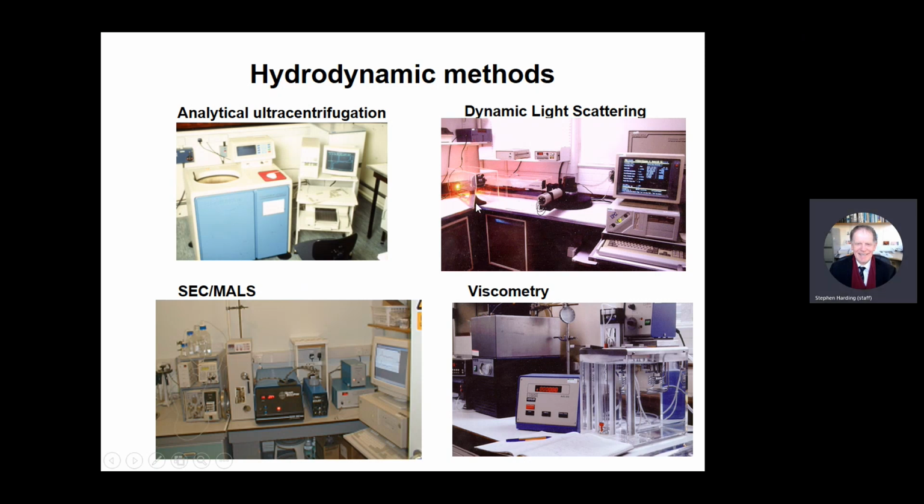This was after I started here in the 1980s. This was one of the first instruments that I acquired, helped by generous donations from various companies like Unilever. We got this set up. So here's your laser here. This is where your solution goes in here, and it's in a water bath at constant temperature. And this is the detector system at an angle of 90 degrees. This is the goniometer system, so you can change the angle.